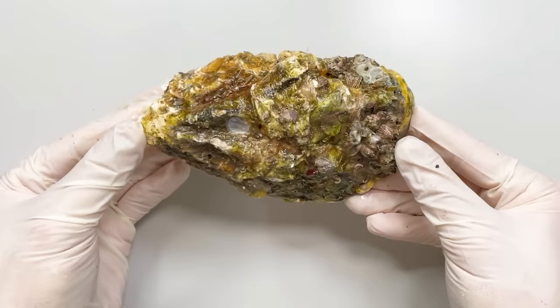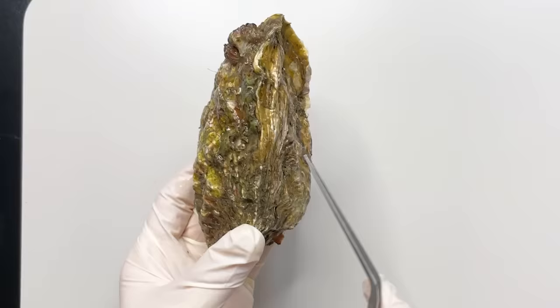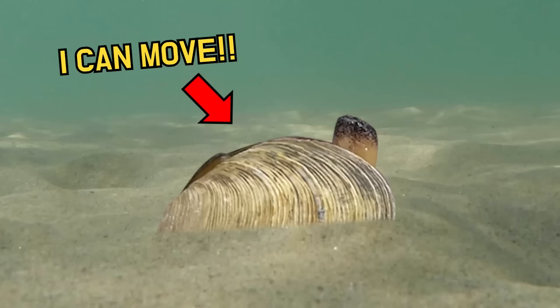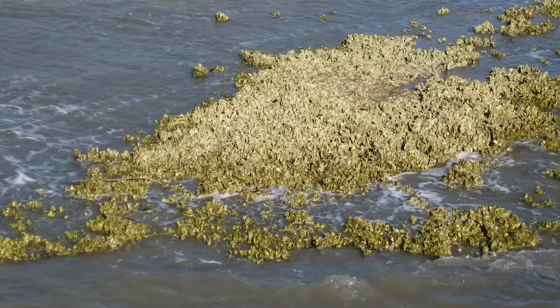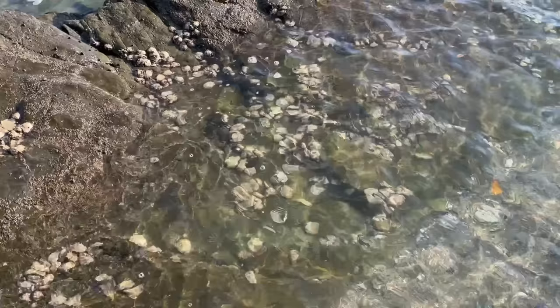I brought a big oyster for today's anatomy. It really looks like a stone. The shell looks so rough that it's hard to tell right now. But the oyster is a bivalvia, so it has two shells. One shell is flat, and the other is round. Oysters are attached to one place and live for life, unlike most bivalvia that can be moved. That's why oysters are also called flowers blooming on rocks in Asia.